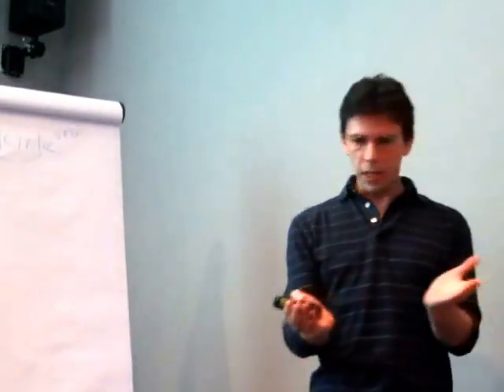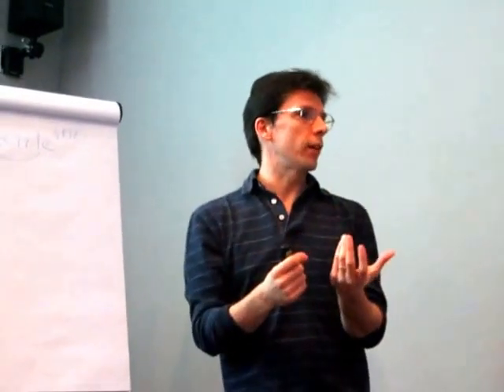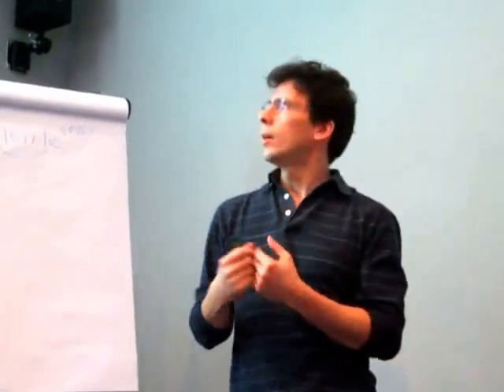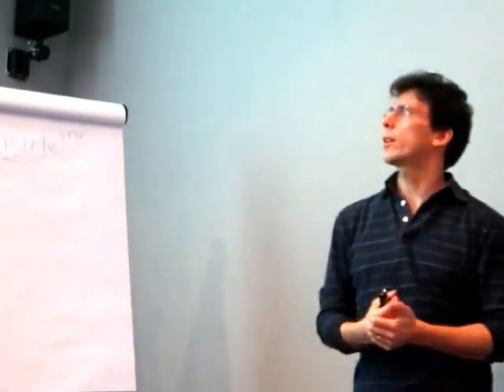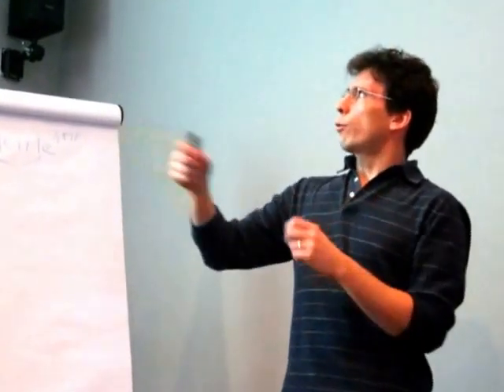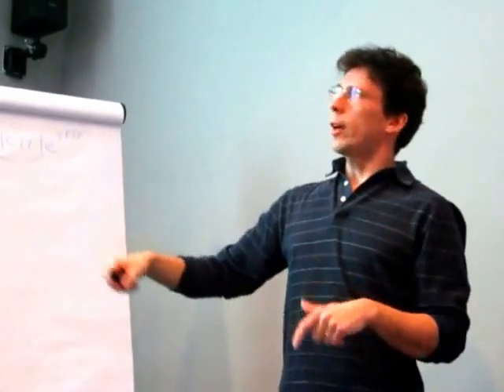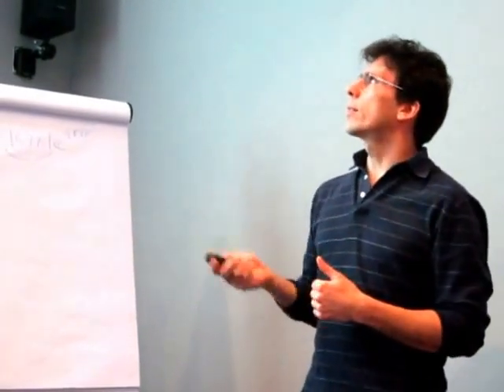So if my images are unaligned with respect to the volume, I cannot distinguish if this particle has tRNA or this particle has factors attached. So for reconstructing, you have to classify, and for classifying, you need to align. So the whole problem is intermixed.